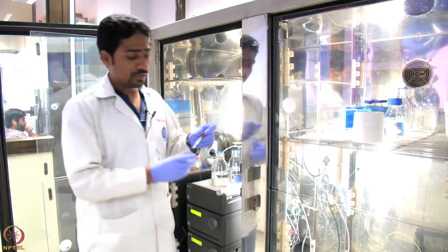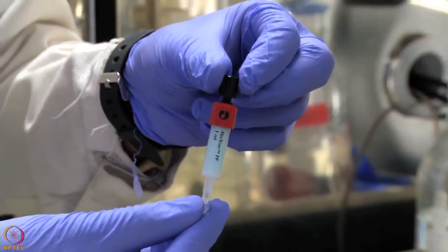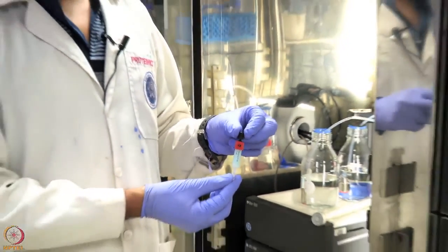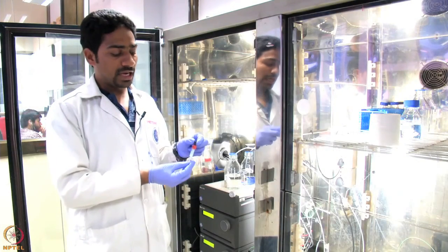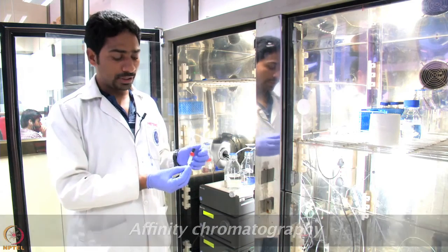There is another column where the reagents are there and the nickel NTA is there. Here we are using the properties, the affinity properties of the proteins.